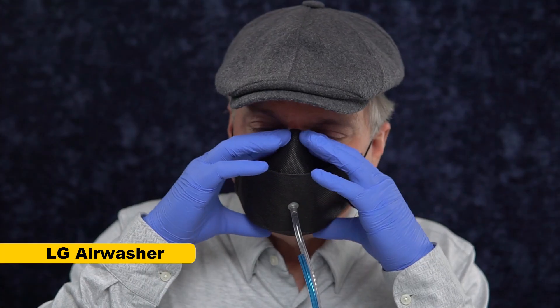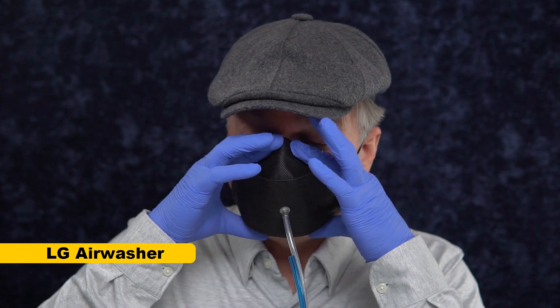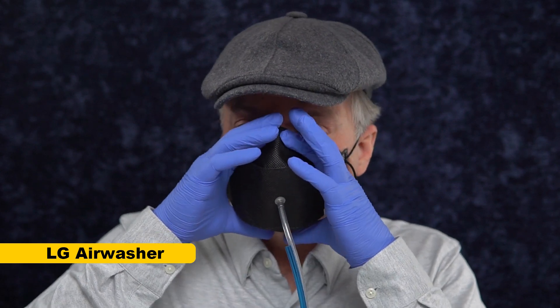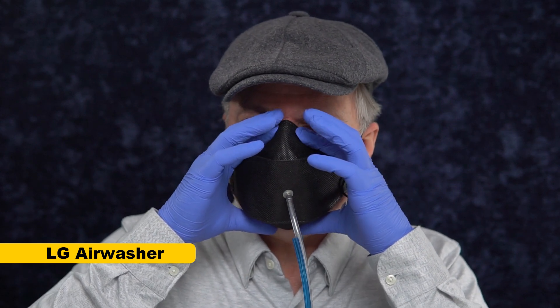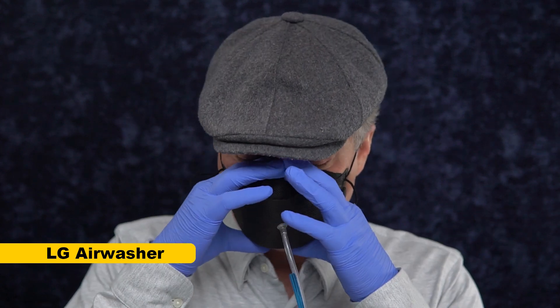To prove it, I'm now gonna test with an LG Air Washer KF94 and see how well it tests with ear loops. I have pulled those ear loops really tight to give this the best chance, and conformed the nose wire as best I can, and I even put it in its best place. We're gonna give this LG Air Washer a test and see how it compares to the score of the 3M Aura with ear loops.